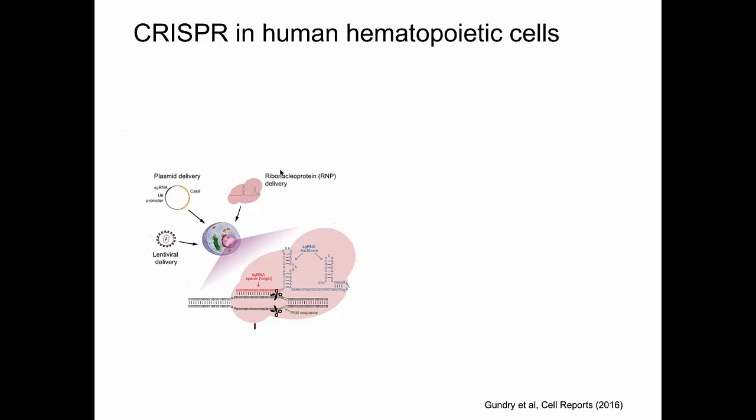And so just to kind of describe our workflow, and I'll go into a little more detail in a second. On day one, when we're screening guides, we make them ourselves using in vitro transcription, and I'll again go through some of the details of that in a second. And with in vitro transcription, we order primers that are specific for each of our guides. They have a T7 promoter, which allows for their in vitro transcription following the generation of an amplicon. So on day one, we do sgRNA synthesis.